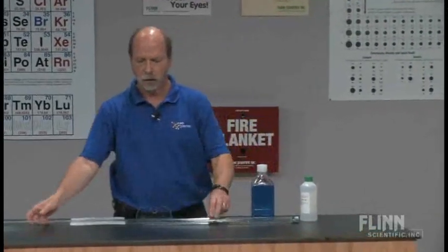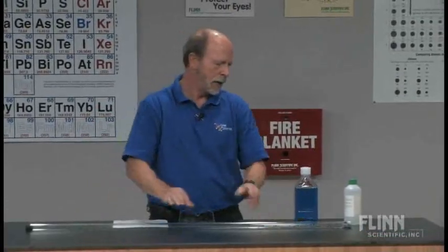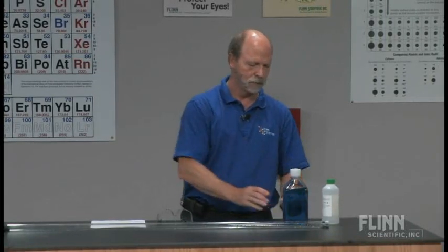Okay, so I'm going to add some water to this tube that I have, this glass tube, and in order to see the water more easily, I've put some blue food coloring into the water.